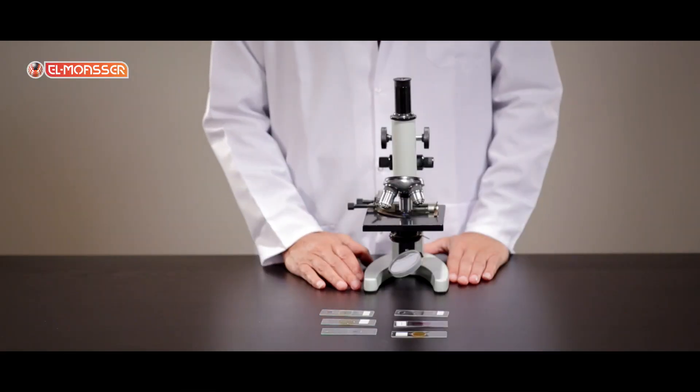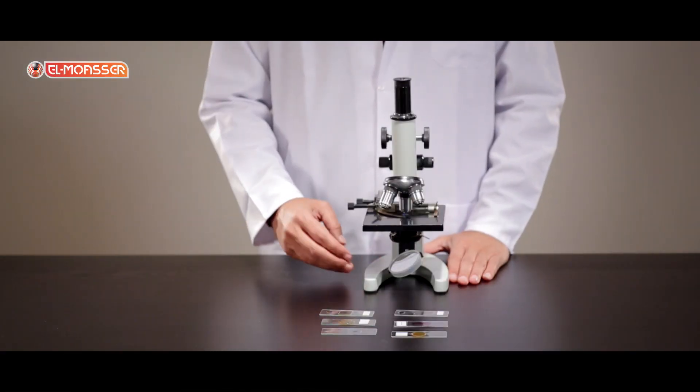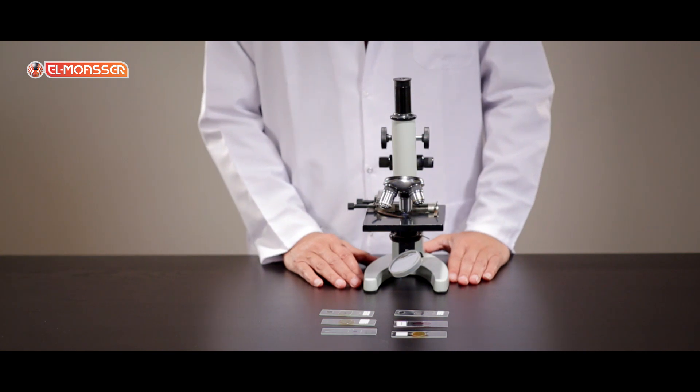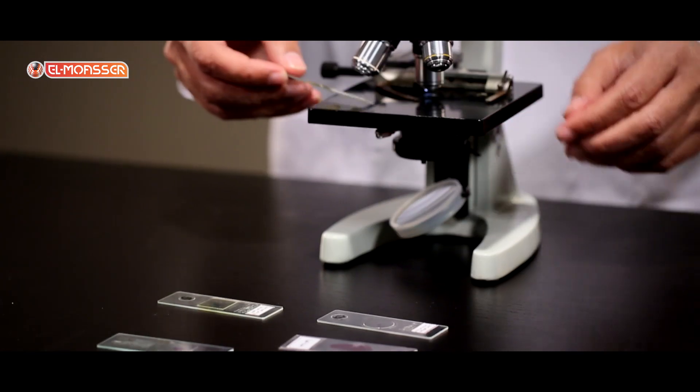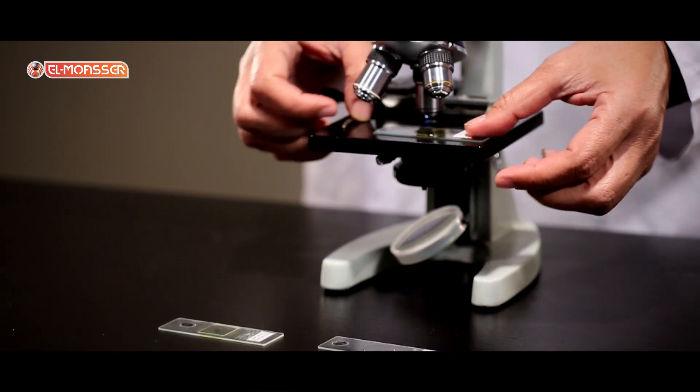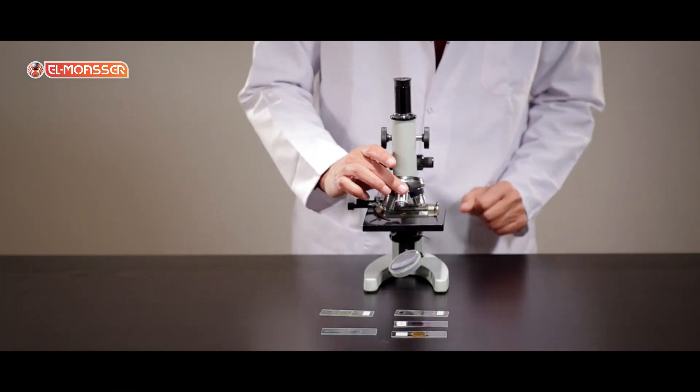Procedure: examine each slide to recognize the name of the tissue and its type, then describe it. Place the first slide on the stage and use the low-power objective lens.